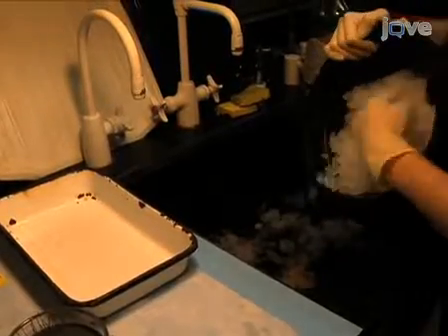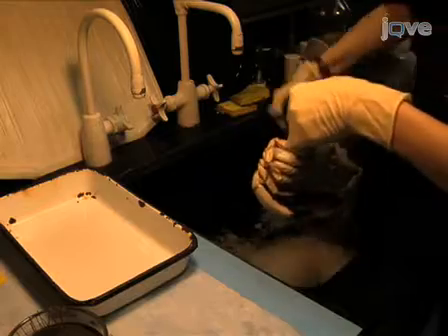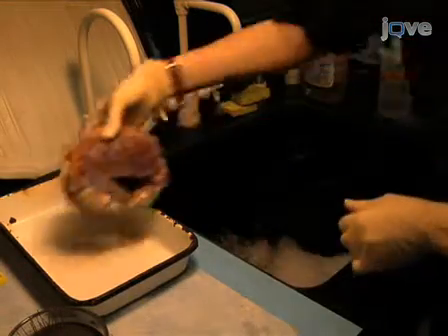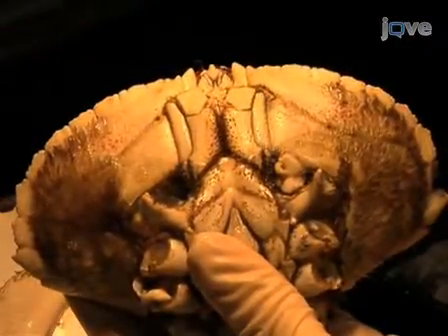Once 30 minutes have elapsed, remove the crab from the ice bucket by its hind leg to avoid being pinched, and place it in the dissection pan. First, remove the claws by twisting each one inward. Next, remove each leg using the same twisting motion. Now that the animal is appendageless, use the rongeurs to remove the maxilla covering the mouth and the soft maxillule.